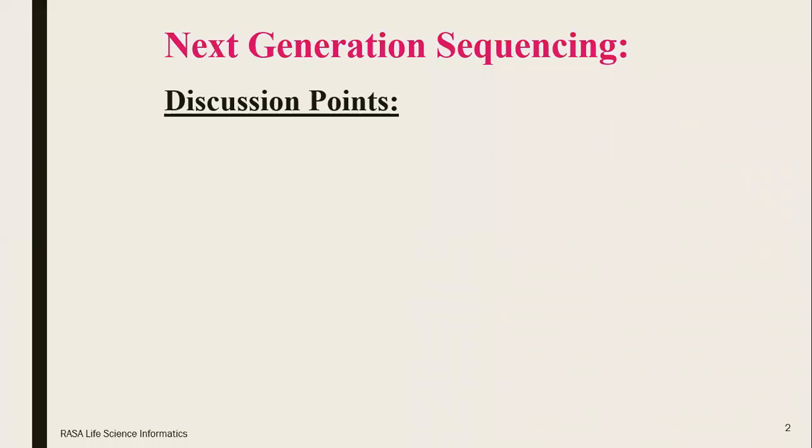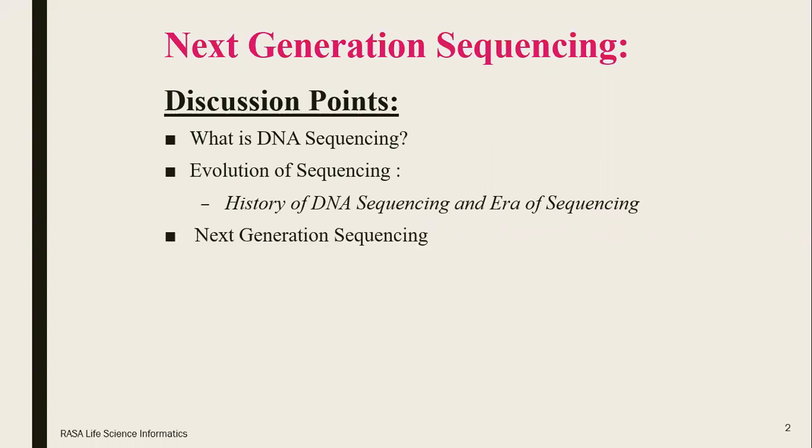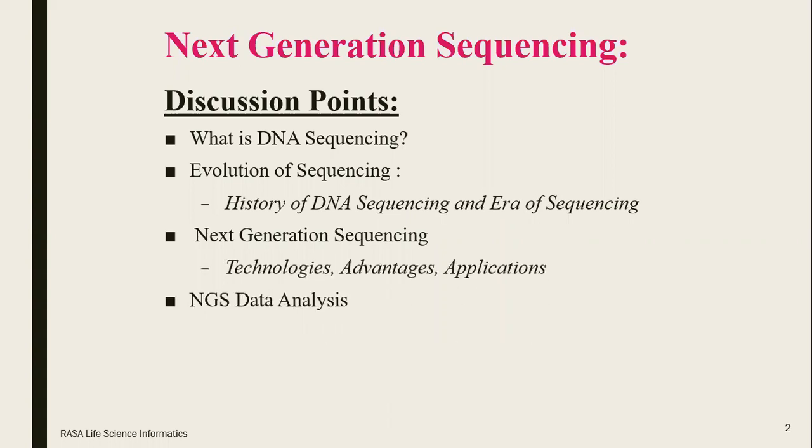Now, today we will focus on points like what is DNA sequencing, then evolution of sequencing, which will cover the history of DNA sequencing, the era of sequencing. Then we will move to what is meant by next generation sequencing, why is it important, different platforms and technologies and applications.